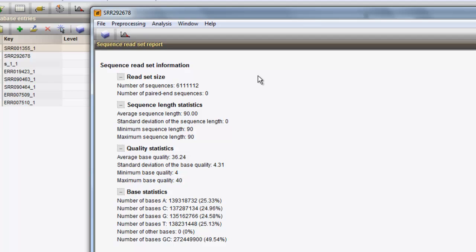From the base statistics, we can learn how many A, C, T, and G's were counted, and how many other bases or N's were detected in the sequencing reads. As for the last statistic, the number of bases GC is indicated, being 49.54% in this case.